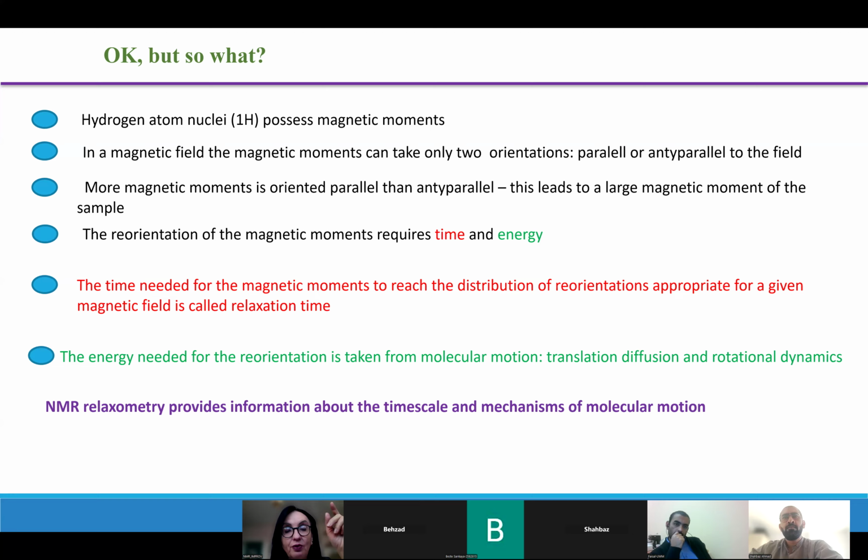And I look at one of them. It will be moving stochastically in all possible directions, forth and back like crazy in the whole glass. And the same applies for any other molecules. However, as we do not distinguish them, for us nothing is happening.